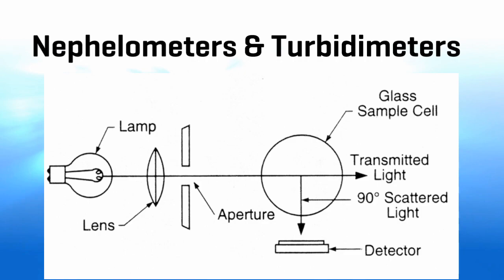Attenuation units and NTUs are equivalent. They are directly comparable and can be used for reporting. Though if your meter reflects it as AUs, say 600 AUs, and you're reporting it to the EPA, they're going to want you to put 600 NTU on it just for reporting purposes. But they're equivalents. They're the same thing. Some meters will use AUs but simply reflect it on the readout as NTU. On ours, we reflect it as AUs simply because we want you to know what we're using to collect that sample, but we do get a few questions on that, and so they are equivalents.